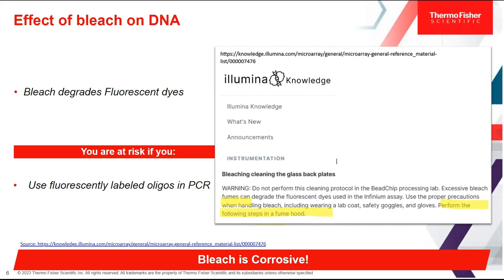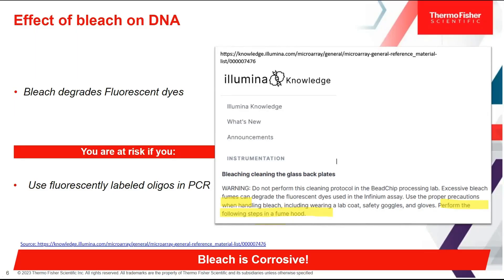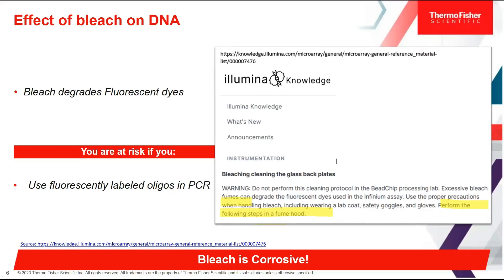The fourth effect concerns bleach and fluorescent dyes. In experiments such as PCR, we use primers and dyes, and bleach fumes have been shown to impact and degrade the fluorescent dyes used in HID multiplex PCR kits. This can lead to a partial profile or no profile at all. It is the fumes of the bleach that cause this impact, and an excerpt from one of the dye kit manufacturers shown here explicitly says to avoid using bleach when preparing for your PCR.